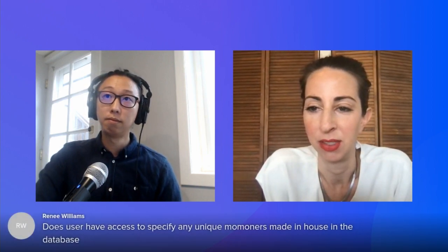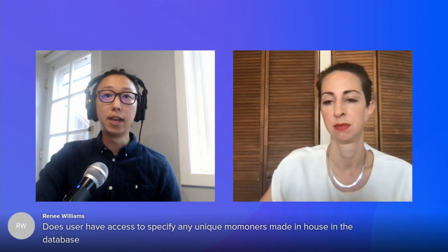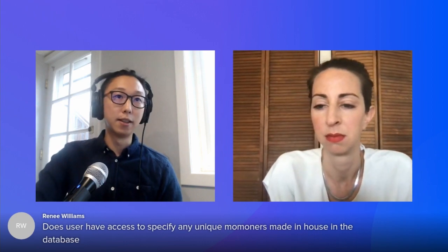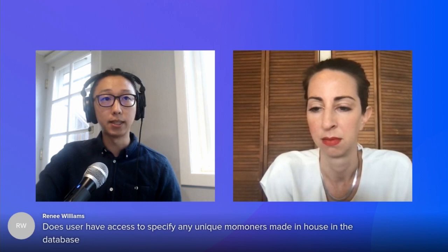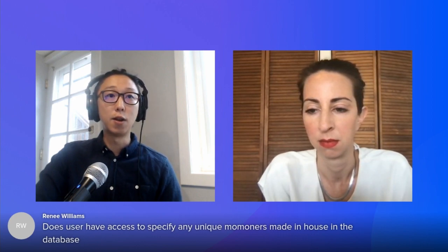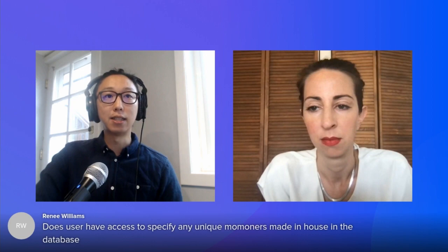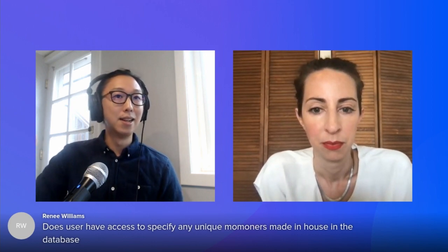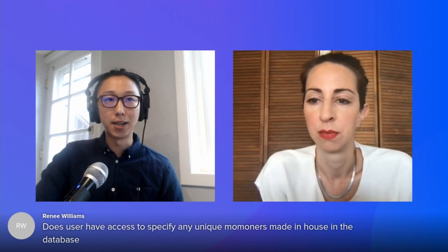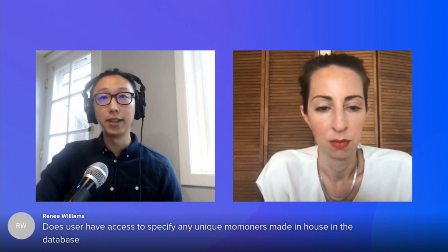And then Renee's question, I think, is really related. Do users have access to specify any unique monomers made in-house in the database? Yeah, we definitely have the flexibility to specify unique custom monomers made in-house. We have not fully exposed the UI path to do this yet, but we have internal tools to help us curate and manage all of the monomers that might exist in a customer's monomer library. Again, as long as a customer is able to provide that chemical structure representation of what that monomer is and provide some of the additional Helm details around the attachment sites, the specific natural analog that monomer is supposed to correlate with, we can customize your monomer library as you see fit.